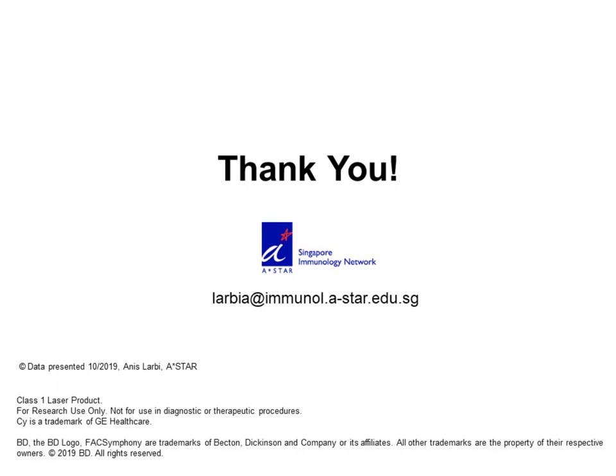For example, BD has a kit with a CD4 clone, or you can buy the antibodies individually. That can help you to do this in a systematic manner.